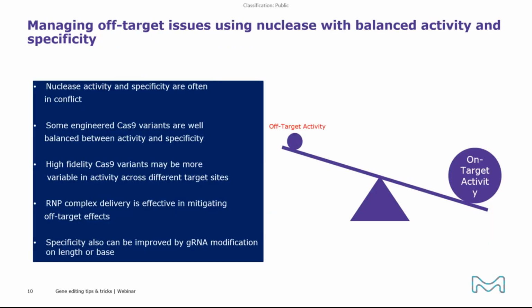If you are really concerned with potential off-target effects, we recommend using a nuclease with balanced activity and specificity.